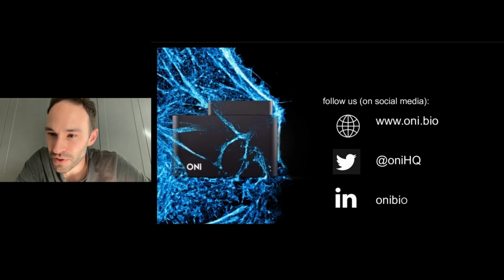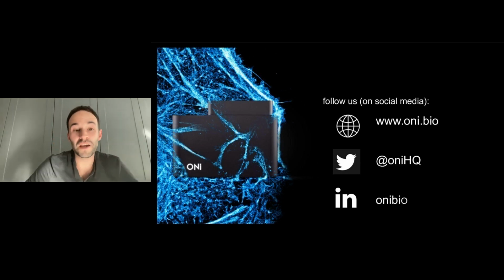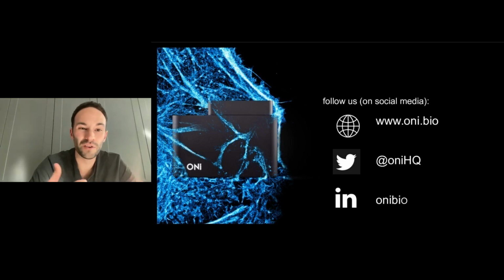So there was a question here: what's the molecular process for which, in your opinion, you can get more advantage from super resolution in immune cells? Well, for me, it's probably the clustering and looking at the co-localization of different molecules. As I discussed, with this kind of signaling behavior, on a CAR, for example, do you get predominantly ZAP70 recruited, or do you get PKC alpha? You know, these different molecules.